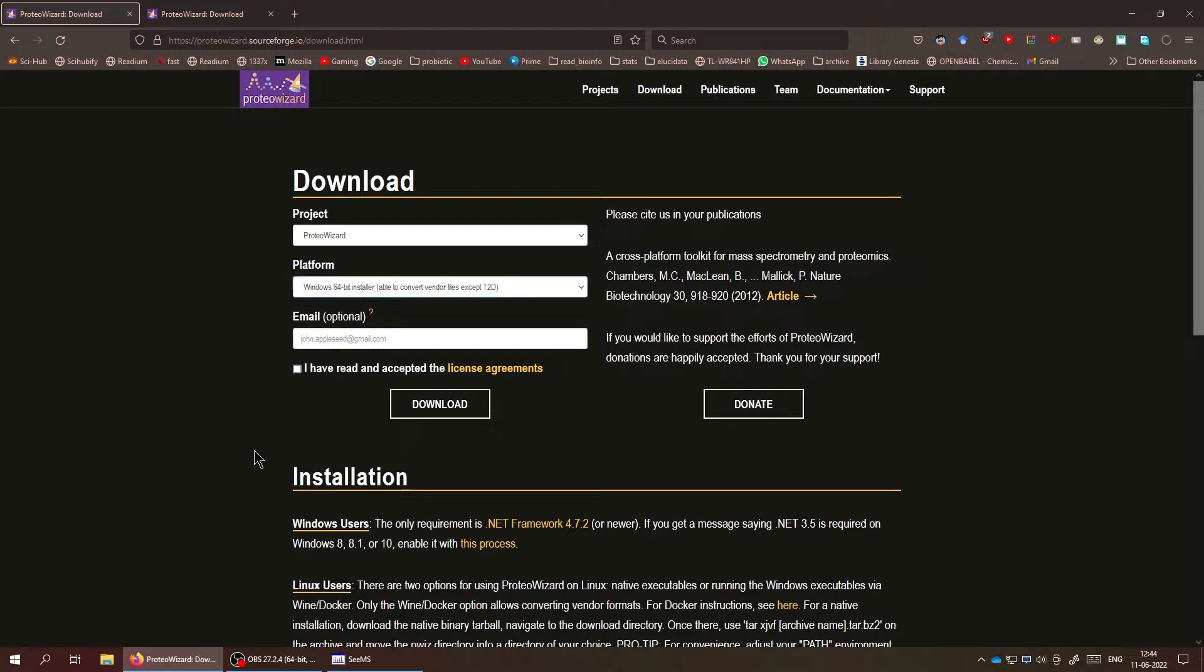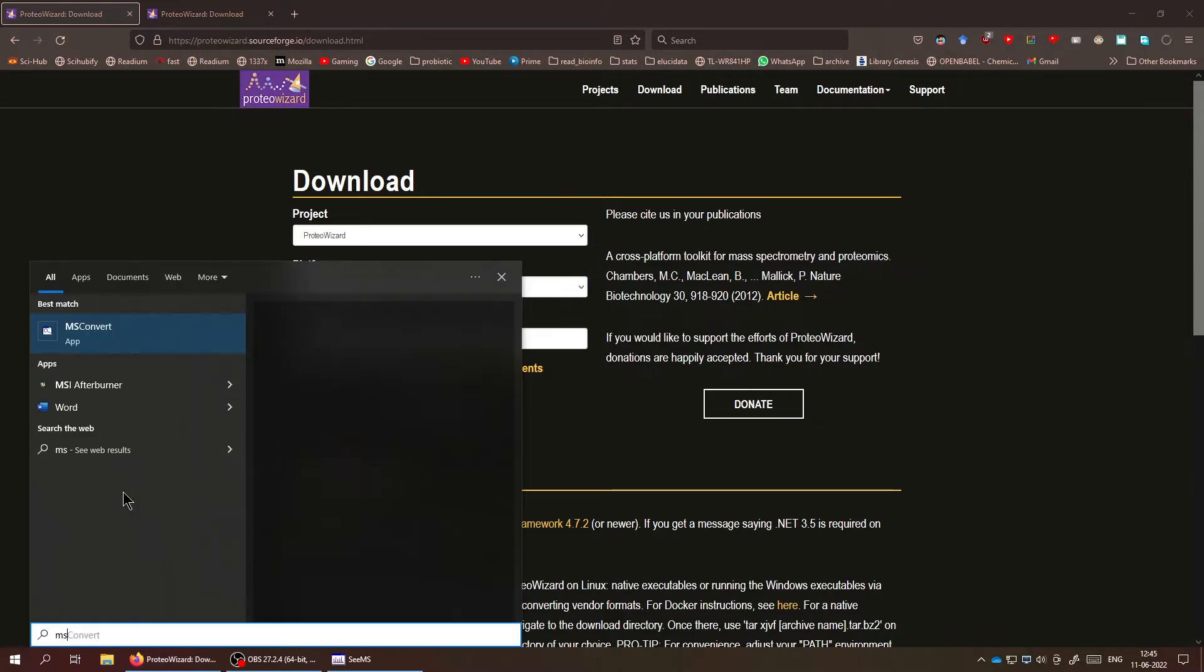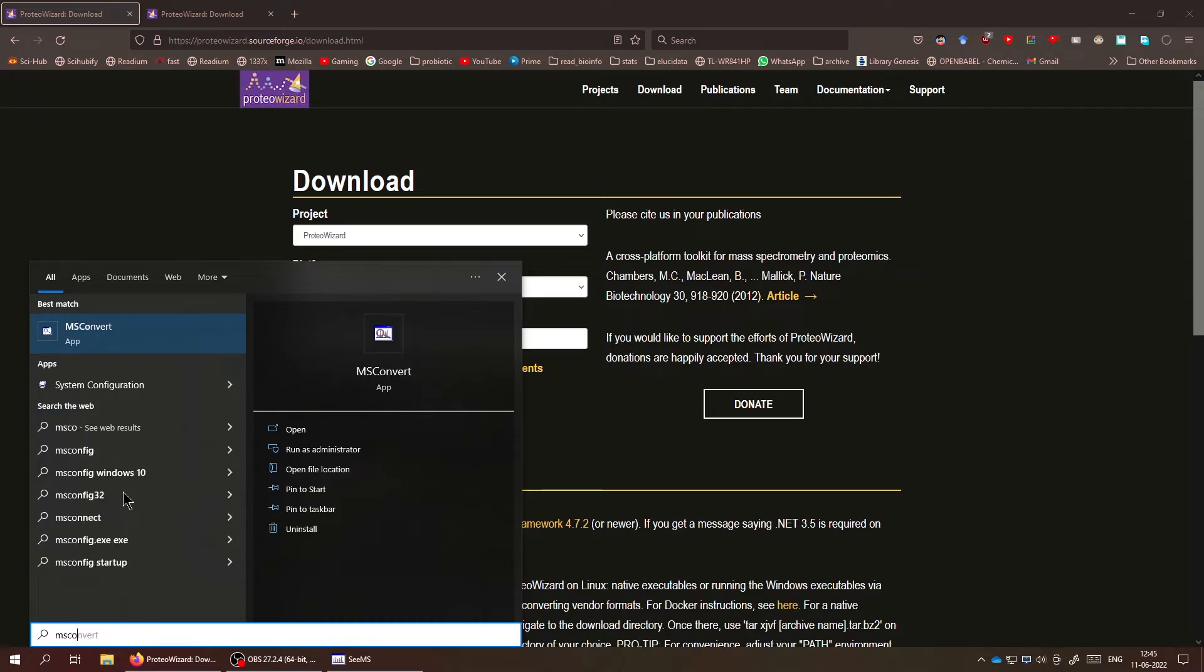Now after you download and install it, you get two softwares. One is MS Convert, which is used to convert raw file formats into the open MZML or MZXML formats. And the other one, which we're going to talk about today, is SeeMS.